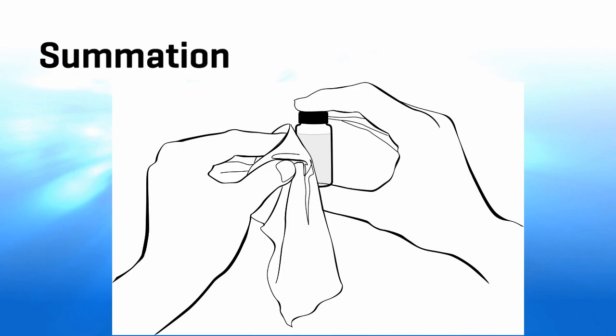If you get scratches on them, there is a school of thought out there that says you can put a few drops of silicone oil on it and rub it in, and that will get rid of the scratches. I don't believe in that. I think that adding a thin layer of oil is going the wrong direction. That's only adding more stuff between the light source and the detector. These things are not that terribly expensive, so if you get a scratch on them, throw them out and use a new one. Once it gets a scratch on it, that's going to be a problem. I wouldn't use it anymore.